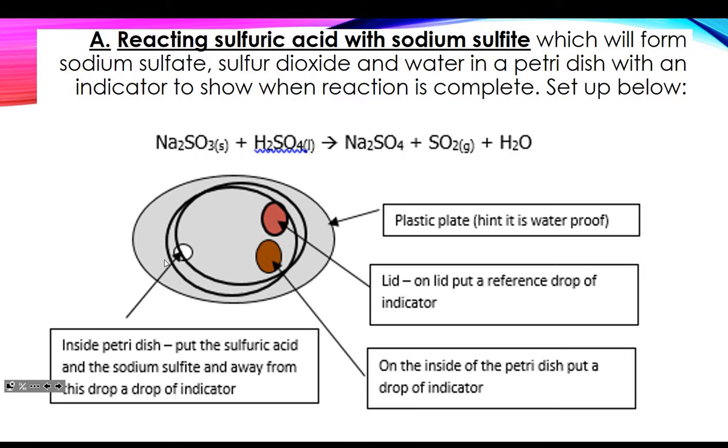So when we're done with this one, this is a precaution I forgot to write in that would be one of your safety things from on your white paper that you need to write down: you do not want to open the lid of the Petri dish until water is running, and you put it right under running water. So it will grab any of the sulfur dioxide and put it right into water.